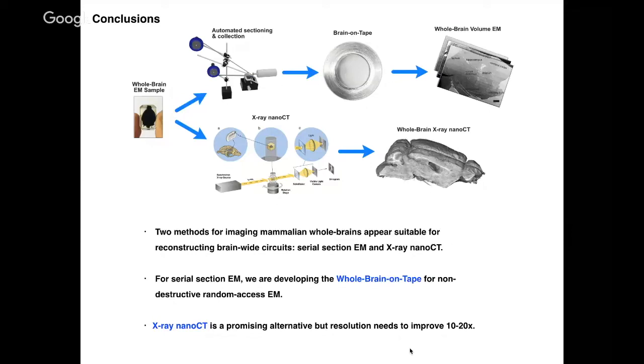And then what you have are a series of projections that you have to use some sort of algorithm to back project. And this is something that you run on a cluster that might take a few weeks. And so we're talking about a few weeks for nanoscale whole brain data versus over a year if you go the EM route. And so if Nano-CT can push the resolution a little bit, it's just going to make cellular resolution connectomics commonplace. It's going to make it easy.